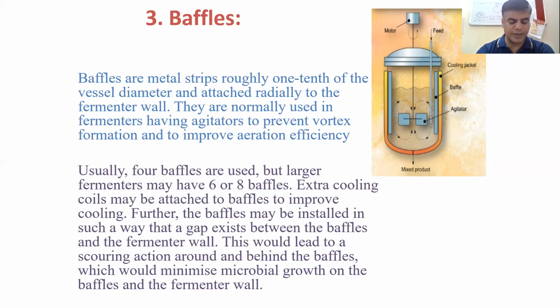So it is important to break the vortex formed by using a baffle. Baffles act as a barrier which breaks the vortex. This would lead to a scouring action around and behind the baffle, which would minimize microbial growth on the baffle and the fermenter wall.